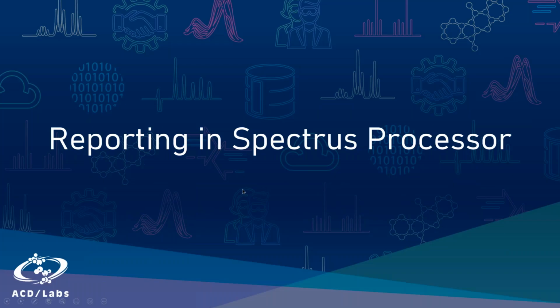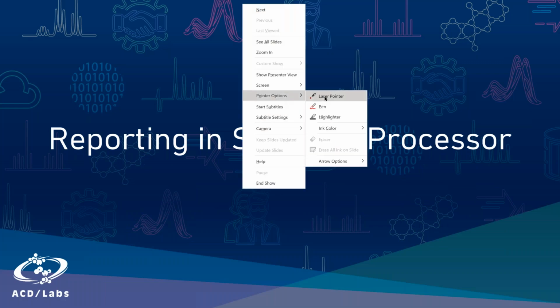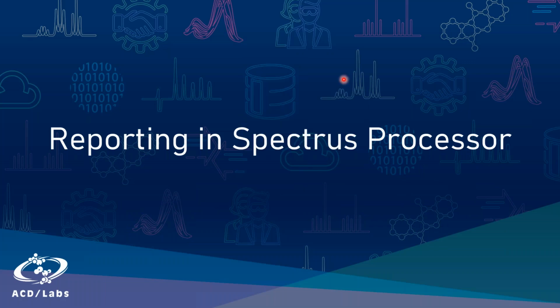All right, that's awesome. Perfect. Thank you again for the introduction and welcome everyone to today's power lesson. We will focus on reporting in Spectrus Processor, as Allison just said, and as some of you might know, Spectrus Processor comes with quite a powerful reporting engine, and this can allow you to generate reports from your data analysis, of course.